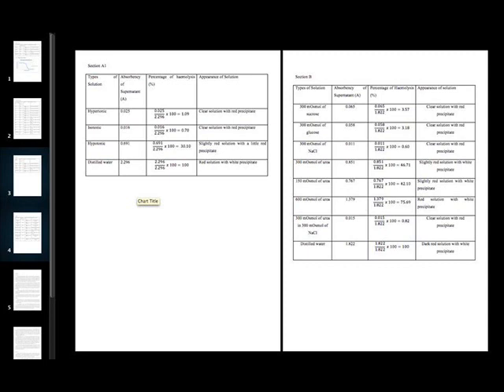In the test tube containing 300 milliosmol urea in 300 milliosmol sodium chloride, it behaves like an isotonic solution. Urea is a penetrating solute, while sodium chloride is a non-penetrating solute. It is hyperosmotic but isotonic to the erythrocyte. There is no net movement of water into or out of the cell, hence minimal hemolysis and the supernatant appears clear.